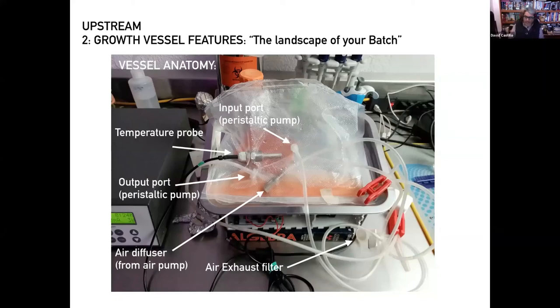So with that, I'm going to start doing this very quick demo, because we intended to do that in the lab, but unfortunately the lab where I have the majority of the reagents and everything had a bad connection yesterday, so we decided to run a quick demonstration. So I have the bag here. It's essentially the same rack that you saw, with all the ports. And what I'm going to do is connect it to the port of our peristaltic pump, so it can start pumping this colored water into it.